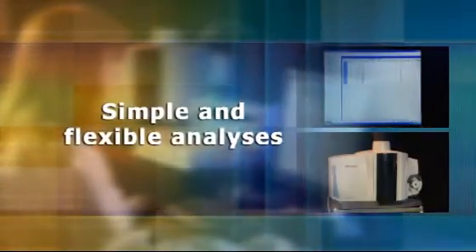ITIVA is a comprehensive, fully-featured ICP software package designed to enable simple, flexible, automated autosampler analyses.